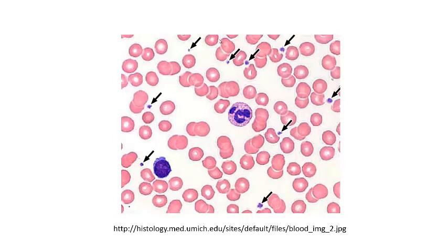This is blood histology. Here at the end of each of these little arrows we have platelets.